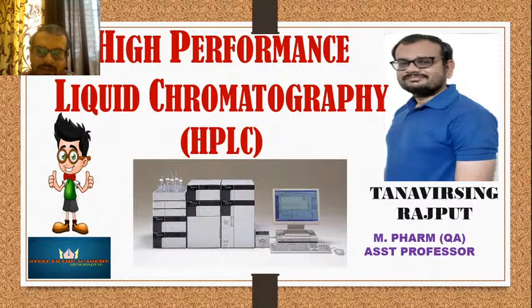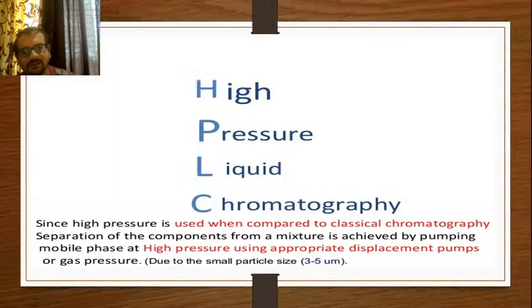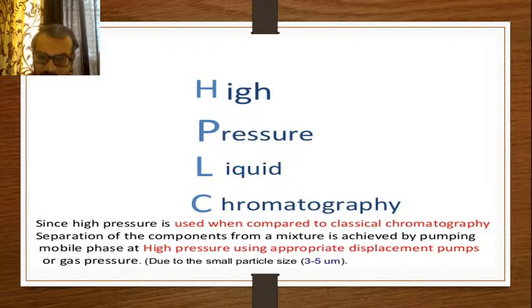We have already started with HPLC, its introductory part and applications. There were some questions from your side yesterday, like what are the limitations of HPLC. As you can see in this slide itself, HPLC is a very costly instrument. This is the major disadvantage or limitation of HPLC. Next, it requires personalized training. That means it cannot be handled by a layman or an amateur person. You need proper training for handling the HPLC.